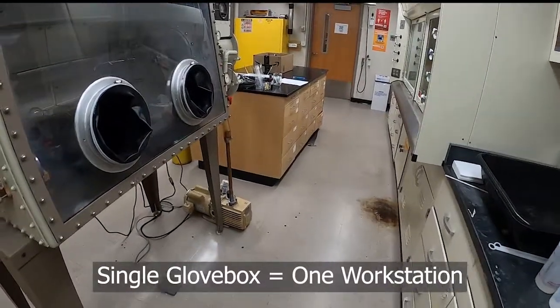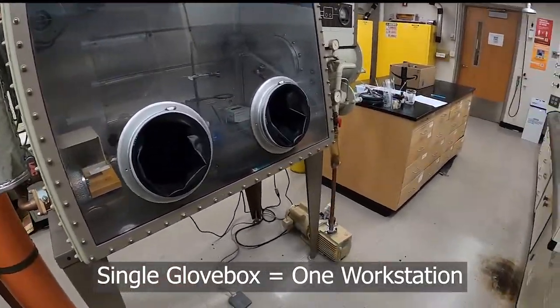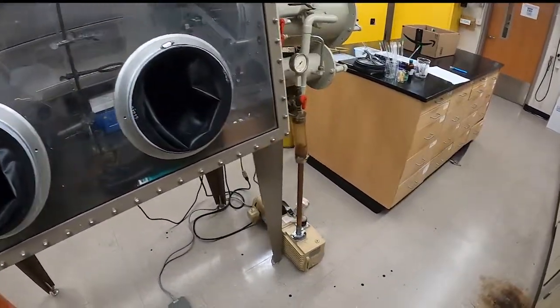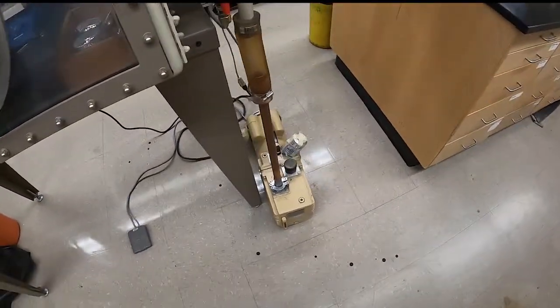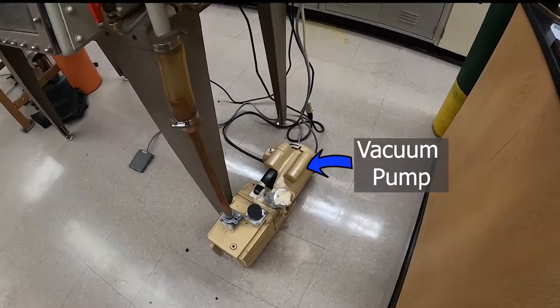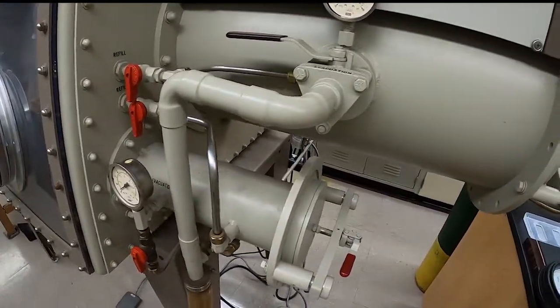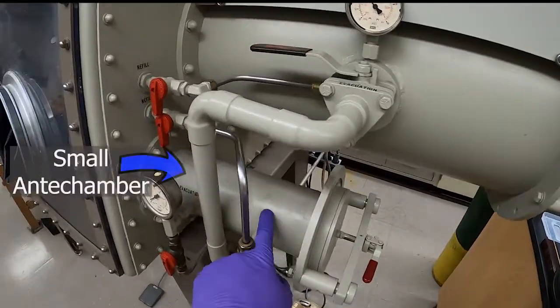This video is going to be an introduction to the glove box. Here's the glove box in the 410 lab — highlighting some of the different parts of it. Here is the vacuum pump; this is what will be used to evacuate the anti-chambers, which are here, here, and here.